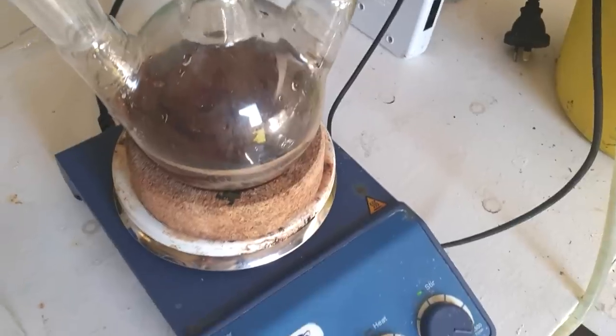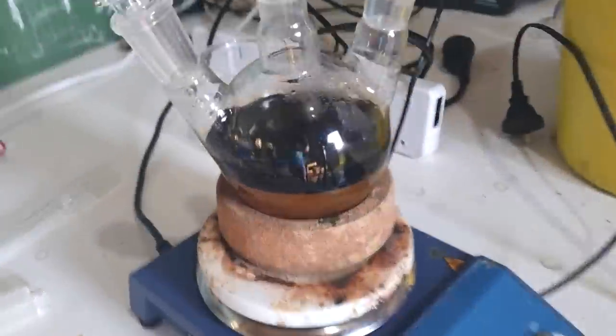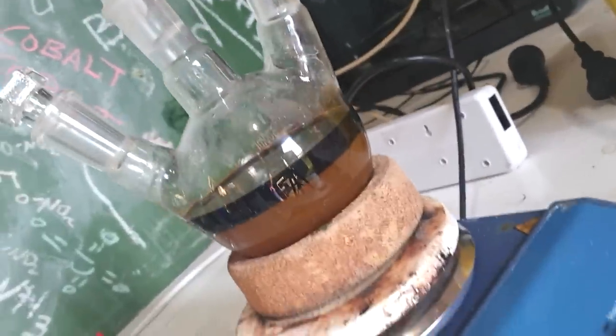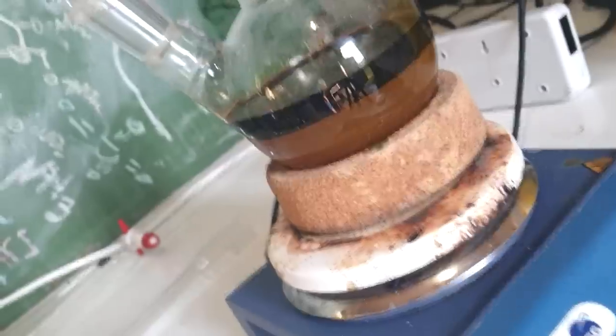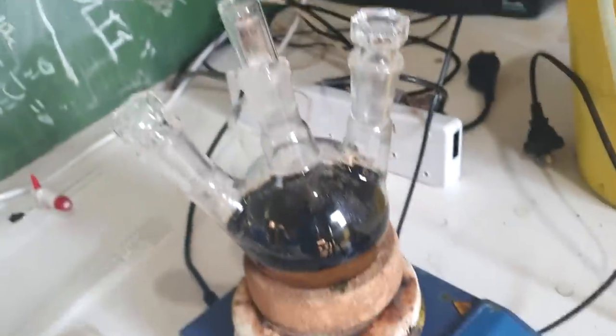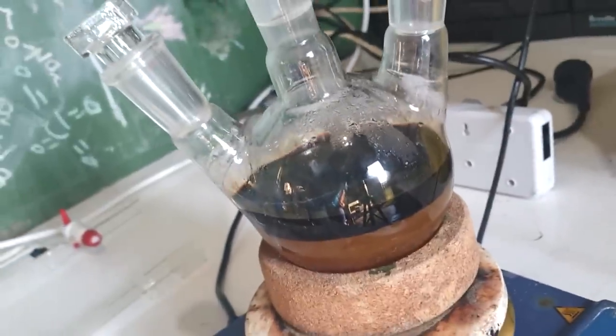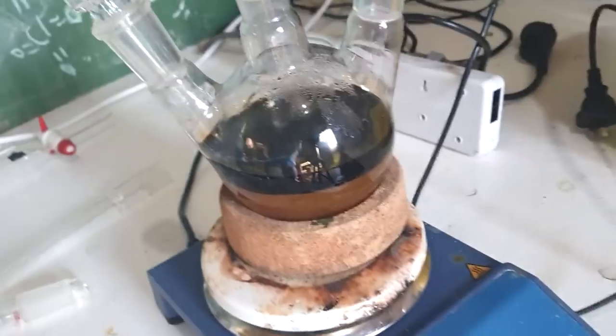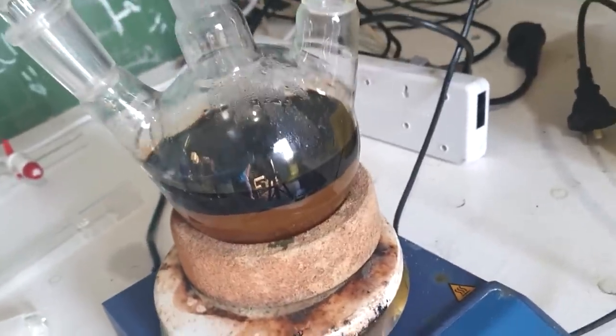Yeah, okay, that's an interesting thought. Problem basically solved itself because that is phase separated perfectly. So we want that top layer, the tarry looking one, and the bottom layer with the precipitate is what we don't want because that's the PTSA. So we'll use the SEP funnel and we'll do a couple more washes just with sodium hydroxide solution and then a brine just to try and dry that top layer before we go to the vacuum distillation.